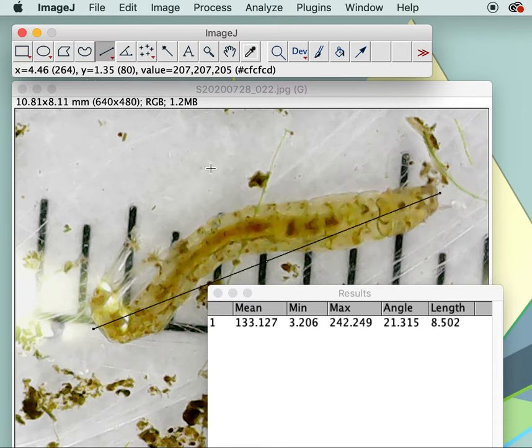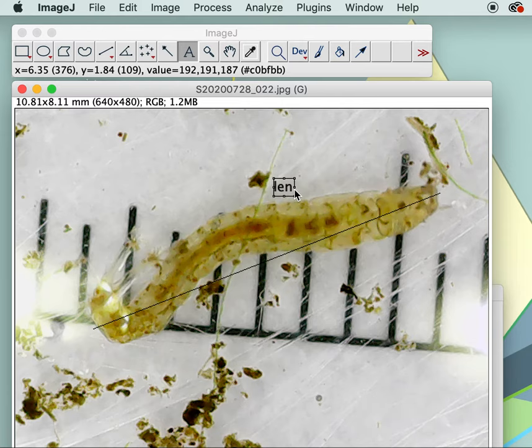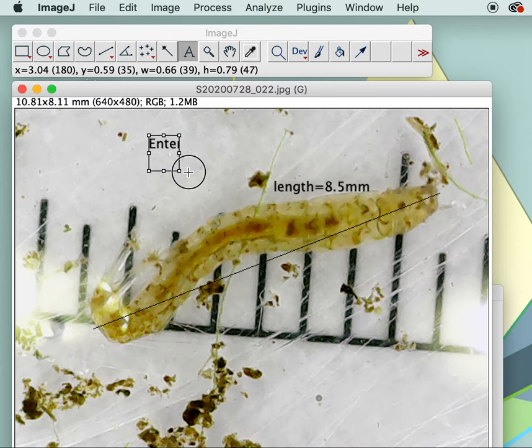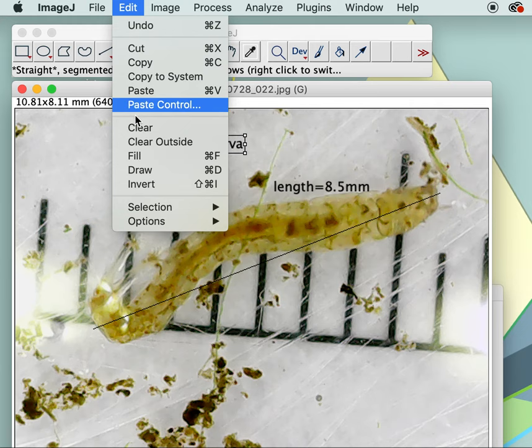Next I want to label the length of my line, so I'll go up to the text tool and make a little text box with the length equal to 8.5 millimeters. I have to make that permanent so I go to Edit > Draw. I also want to label what my organism is — it's a midge fly larva — and again I hit Draw to make it permanent.